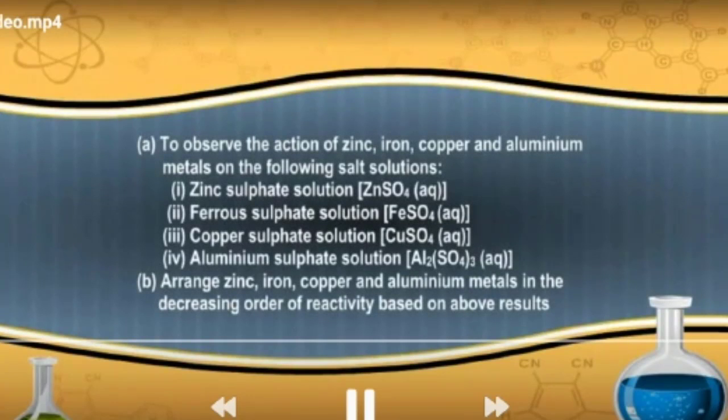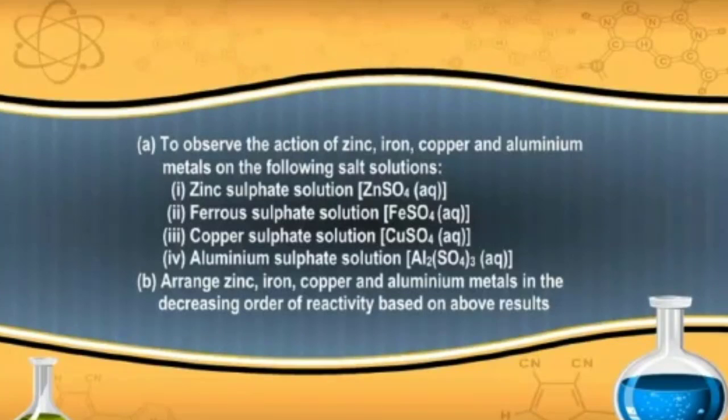Today I am going to discuss the next practical experiment of class 10. A. To observe the action of zinc, iron, copper and aluminium metals on the following salt solutions.